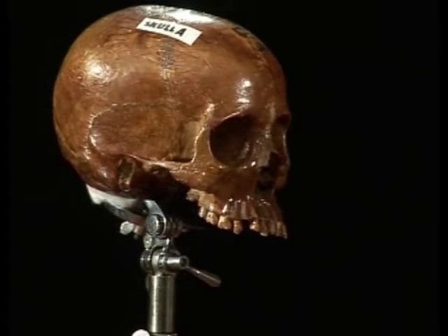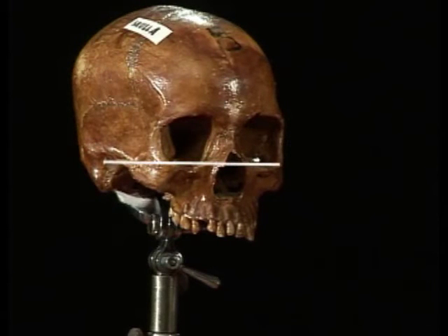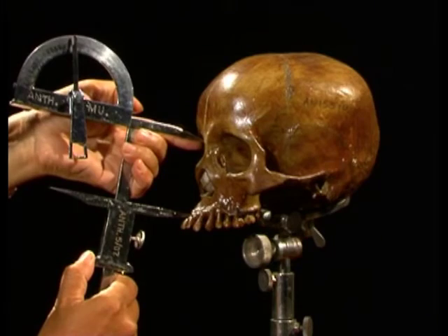In order to take measurements, more particularly angular measurements, the skull must be oriented on a fixed plane, which must be well defined and accepted by all workers. Otherwise, with the variation of the plane, the measurements will vary and hence it will not be comparable.